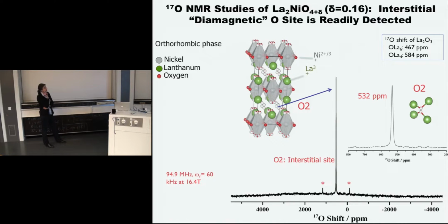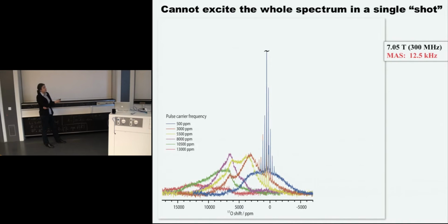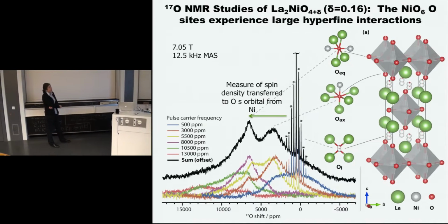So then the question was, where were these oxygens in the nickel layers that we were much more interested in? In order to find them, we had to change the way we did the NMR. We actually had to step through multiple different frequencies. So each of these broad signals is a spectrum acquired at a different offset. And then we sum them all up to get the overall spectrum. And it's very broad and it's not as beautiful as the spectrum here, but you can still make out 2 different resonances. And by just using simple arguments, you can assign the one that's shifted by 1 amount to the oxygen next to 1 nickel, and the one that has double the shift is the oxygen next to 2 nickels. So we've for the first time identified the oxygens in these paramagnetic perovskite layers.